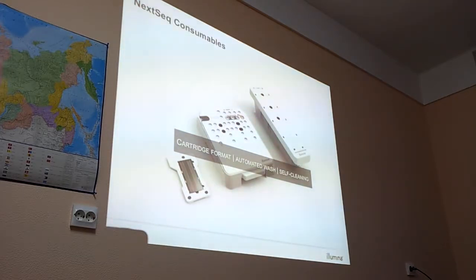Yes. So you should always make a fresh dilution of sodium hypochlorite. It should be between 0.03% and 0.06%. This is all in the manual. Did you print it? Okay, good. Please put it in some folder, and we should use it for the training later. We should really go through the manual step by step.